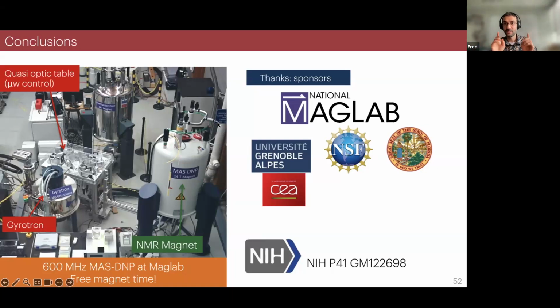Of course, this is not how much you gain. You can't really go past 658 compared to Boltzmann equilibrium. It's because your reference is not Boltzmann equilibrium. A hand wavy explanation is that spinning the sample is like warming up the nuclear spins, and the cross effect acts like a heater.